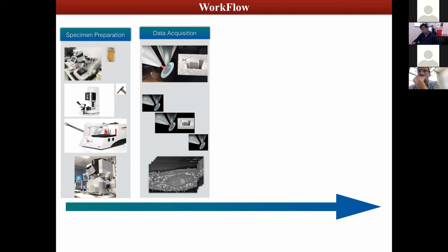Yes, so one of the interesting things, like I mentioned, is that you can collect the data and you don't have to sit in front of the instrument. That's good. You set it up, you put the whole system into your workflow, you have the recipe already done, and you leave. All you have to do is make sure that the liquid nitrogen dewar is all good if you're doing cryo, and that the basic things are there, like the electric supply doesn't trip off.